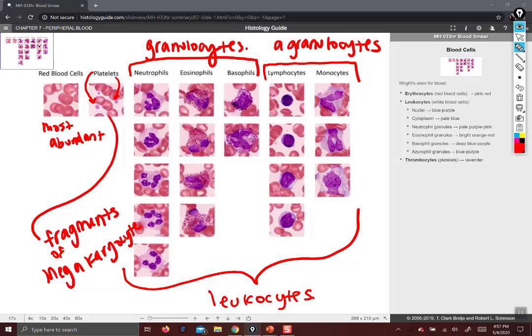Neutrophils are the most common. They have light pink cytoplasm, light pink granules, and a multi-lobed nucleus — they may have different amounts of lobes. This column is just giving you some examples of different shapes that neutrophils can take.